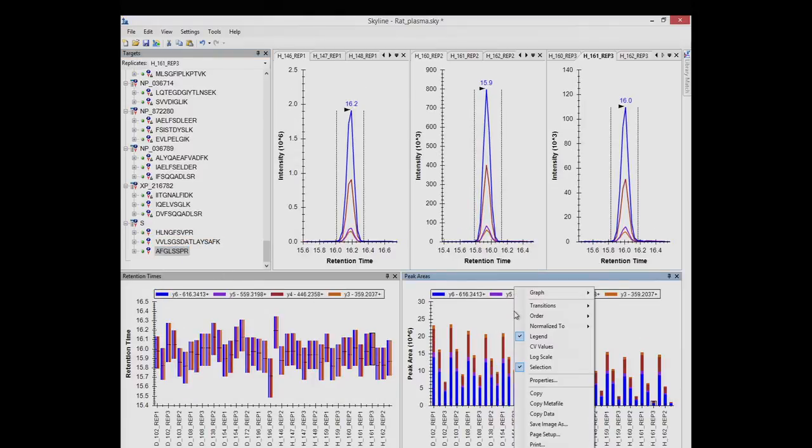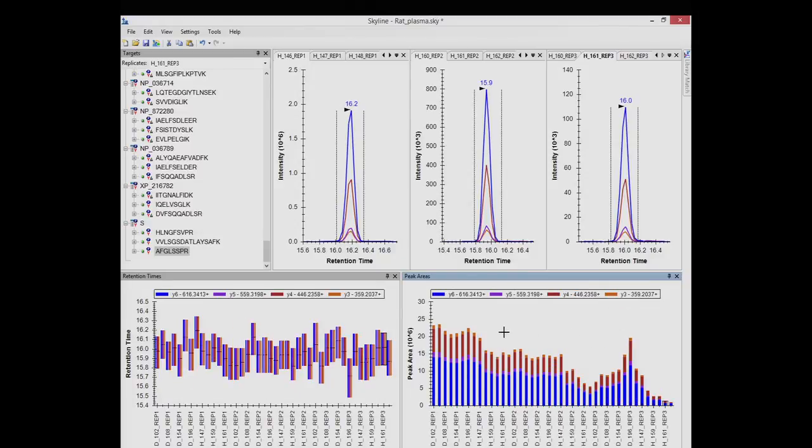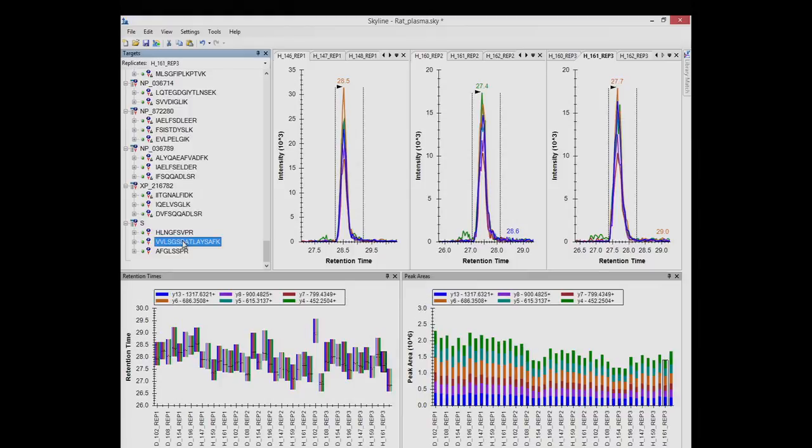Let's sort back into acquired time order. And you can see that it has considerable decline as well, probably more than is explainable by, this is probably some sort of degradation or something going on. This is about a 20x decline from the earliest to the latest. So neither of these are probably good for normalization. So let's go ahead and right click on the middle one.